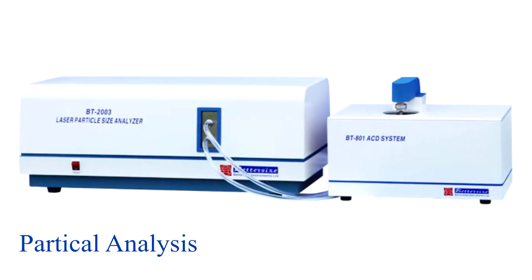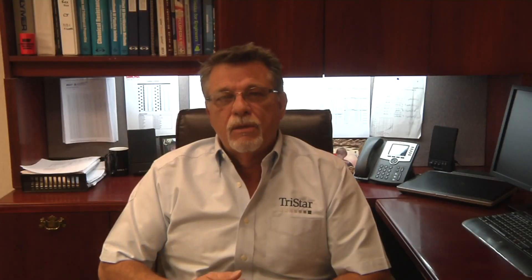The last test is particle analysis. This is another key point in determining whether the materials meet the standards set by Saint-Gobain. It is also critical in determining the blending materials and additives, ensuring that particle sizes are compatible with the PTFE particle sizes so that they get properly blended.